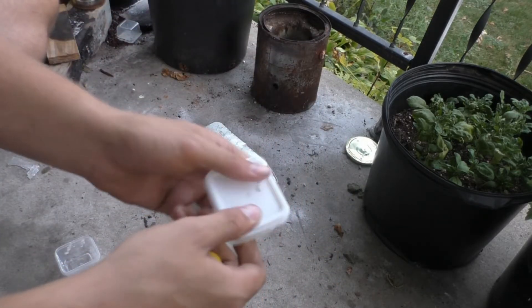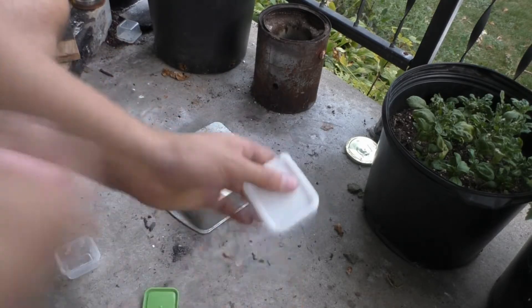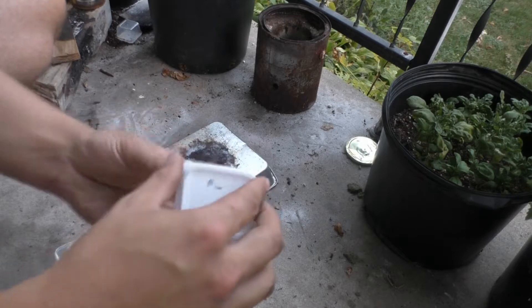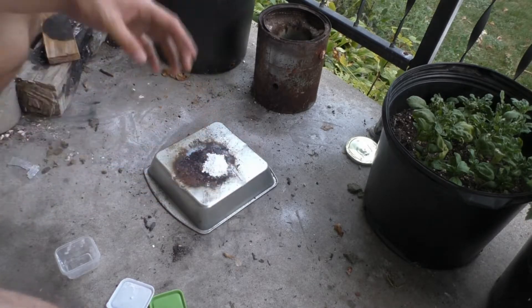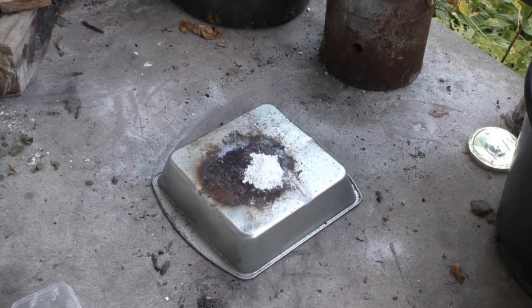You might notice it's a little bit dark, and that is because I'm recording later in the afternoon than I would preferably do normally, because of time constraints getting some of the stuff prepared. All right, it is all mixed up. It smells very fruity. All right, potassium chlorate reaction test.